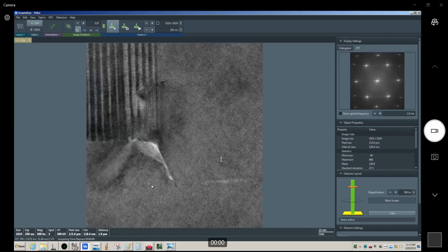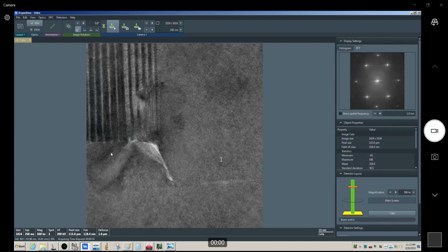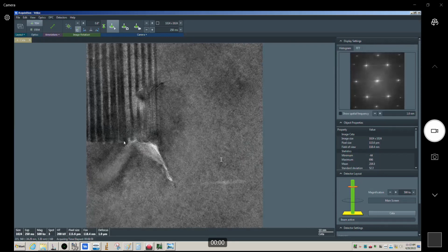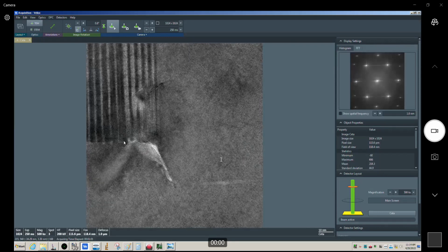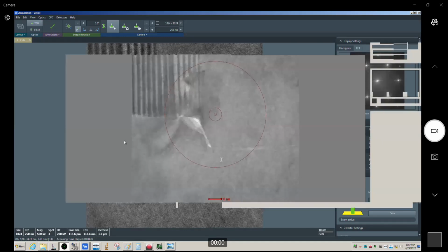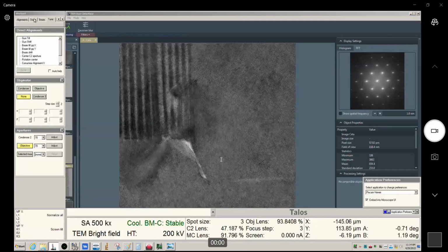The astigmatism correction now is more or less impossible. I just don't have enough of an amorphous signal. So this is where I can correct it at a different place initially. I already corrected it over at the platinum, and then I came over. If I hadn't done that before, I can actually, let me mark the stage position again.